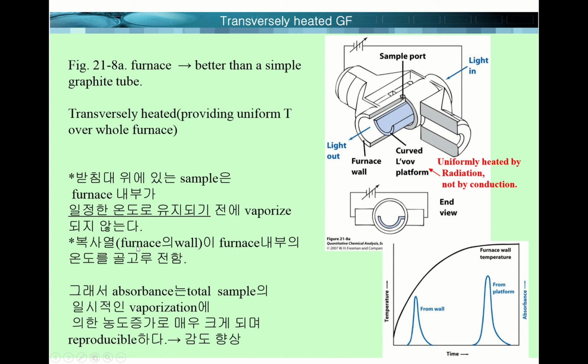The wall of the furnace now distributes the temperature inside the furnace. So absorbance will be greatly increased by total sample vaporization, and reproducibility will also be improved.